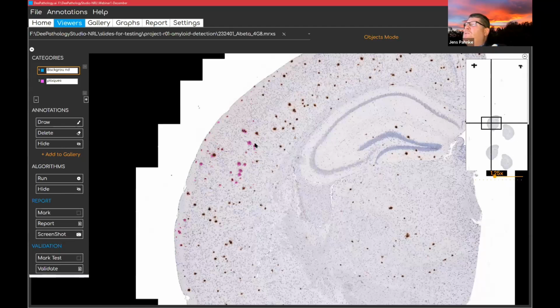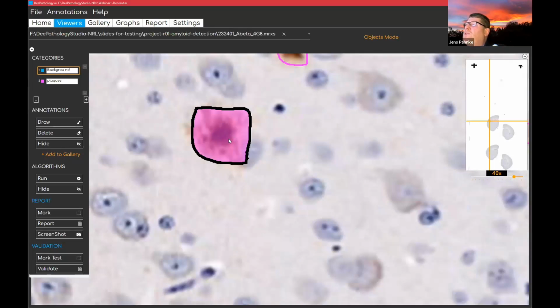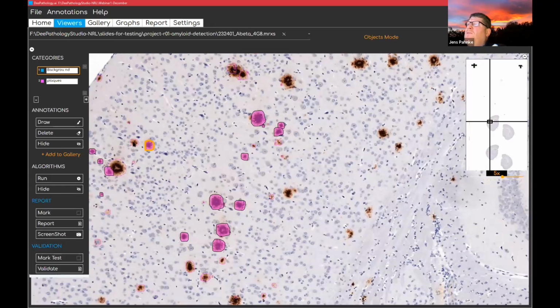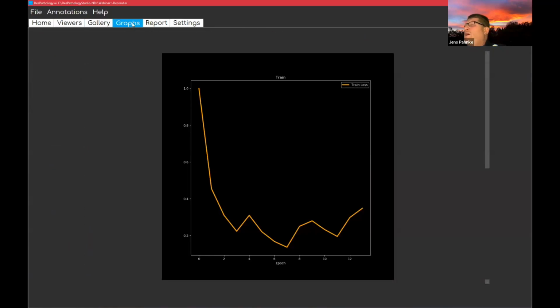And for us, when we treat the animals, it's very interesting to get information about the number of amyloid plaques in the cortex of those animals, but also the size. The size is sometimes very interesting, and sometimes also even the structure of the plaques. Some of the plaques have these core things, some are dense core, and some are the diffuse plaques here. It really depends on the treatment you do that you end up with plaques that change their appearance in a way.